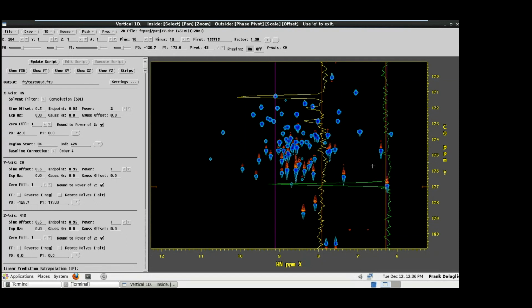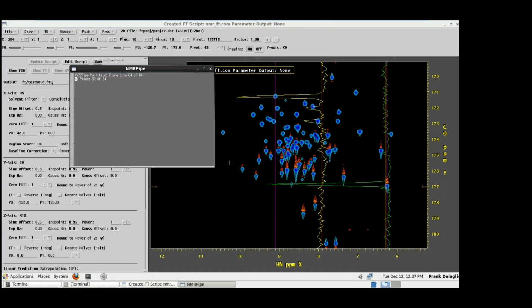Okay, when I interactively phase correct these vectors, what I notice is that the first order phase correction is pretty close to 180. Generally speaking, it means that the spectrum was probably set up so that the phase correction is exactly 180. So if you don't know what the phase correction values are, you should always give it a try with standard phase correction values like -90, 180. So I see that kind of phase correction is needed, and I'm just going to set it exactly to 180-degree phase correction. I'll update the processing script again and execute it to generate a new spectrum.